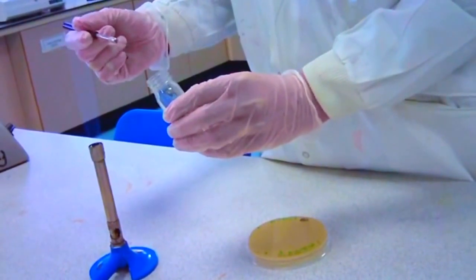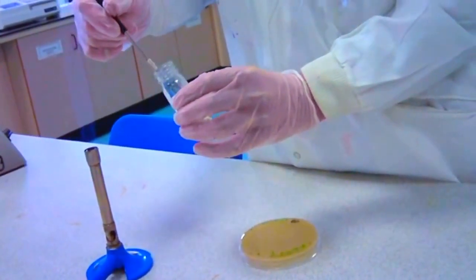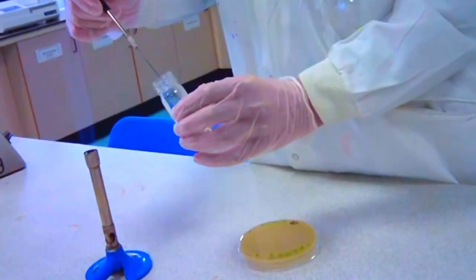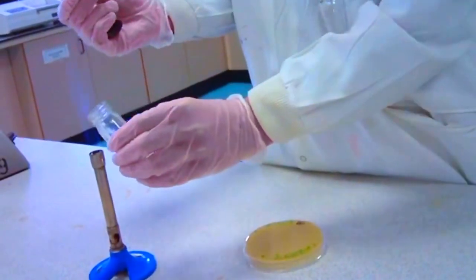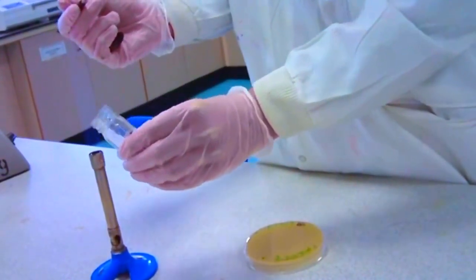Once the bottle is sterile, put the loop into the suspension without touching the sides of the bottle. Remove the loop and then reflame the neck of the bottle before closing the lid to sterilize.